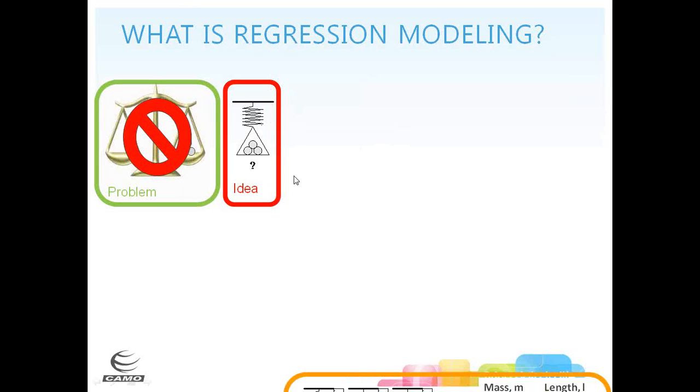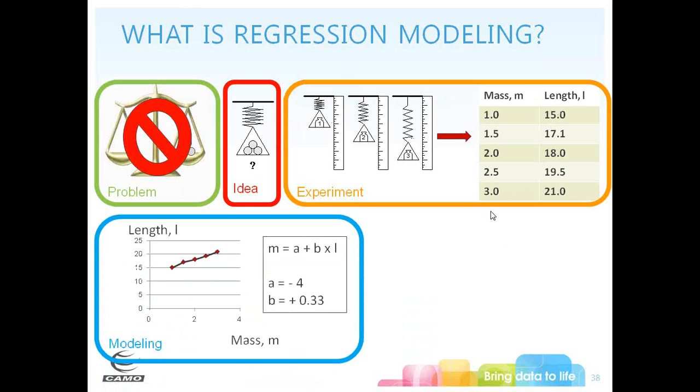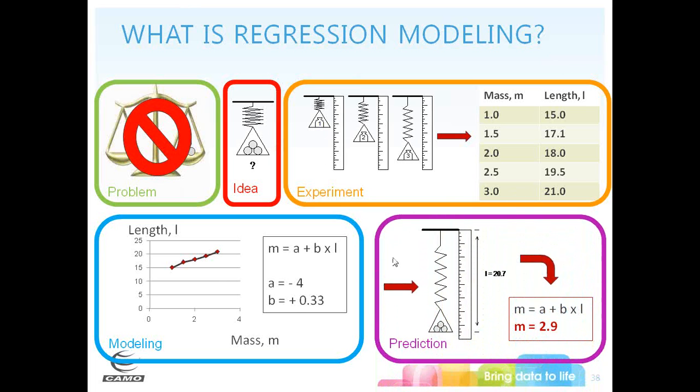So we could relate this measurement using calibration standards to measure how much that spring displaces with known weights, and then develop a regression model, where here we're looking at a single response versus a single variable, where we're relating the length of the spring displacement to the weight that we've applied. But we then have an equation which we can apply to a new sample to get a prediction for what the weight is for our unknown sample.